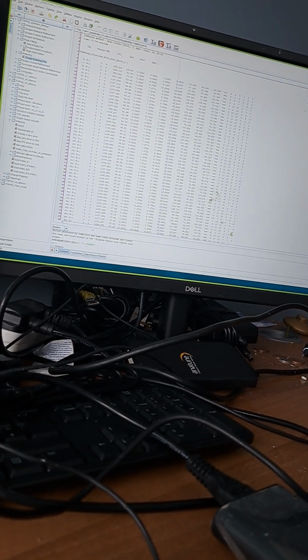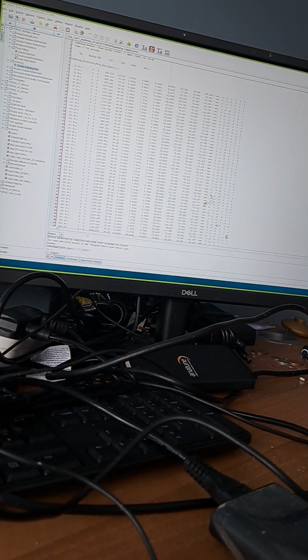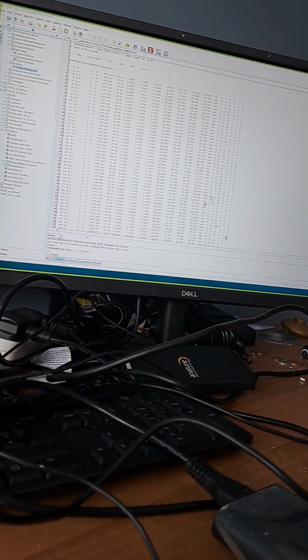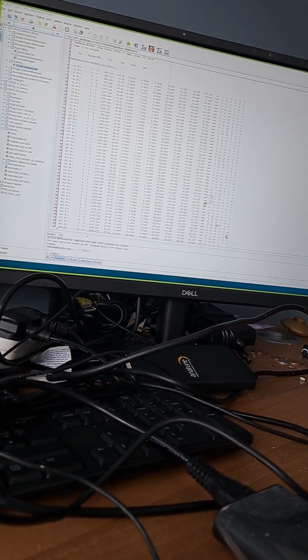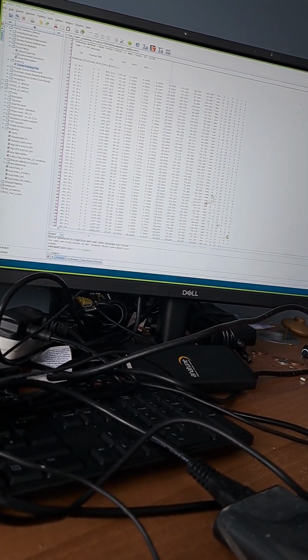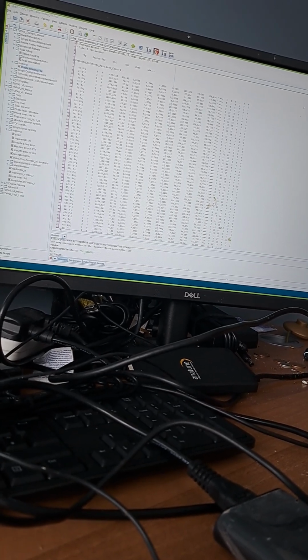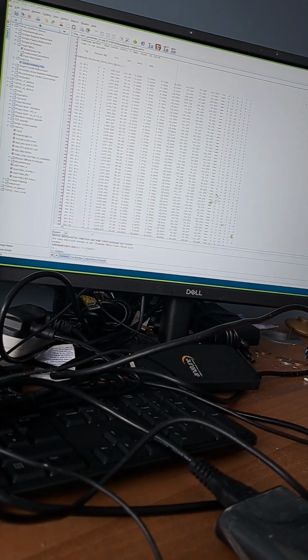So when it comes to feeding in the molecules themselves, you will obviously have PIP, I think, that could be used as miconazole, okay? And then you could take any hydrochloride salt from the database, any CIF file with a hydrochloride salt, and open that CIF file in there.